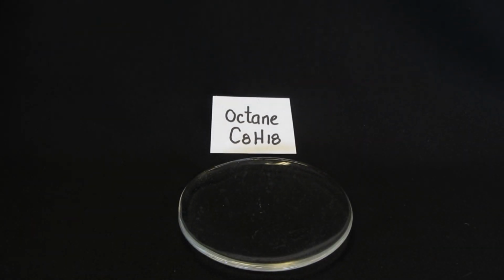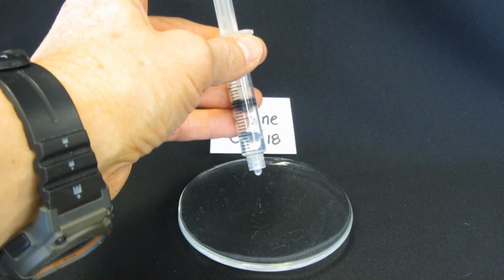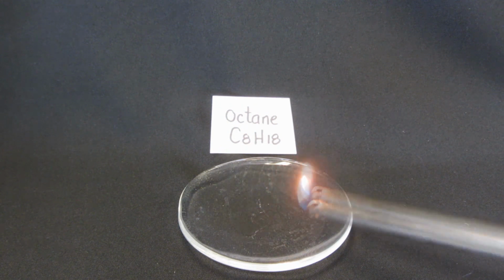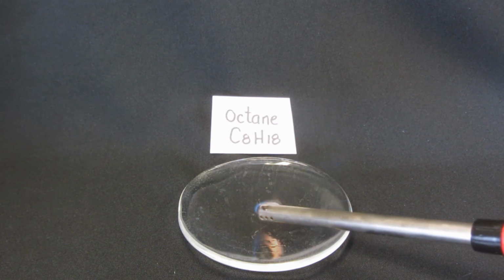This is octane, C8H18. It's not nearly as volatile as methanol. Its boiling point is quite a bit higher. It's around 125 degrees Celsius, and so it's going to take a little more heat to get it to start to burn.